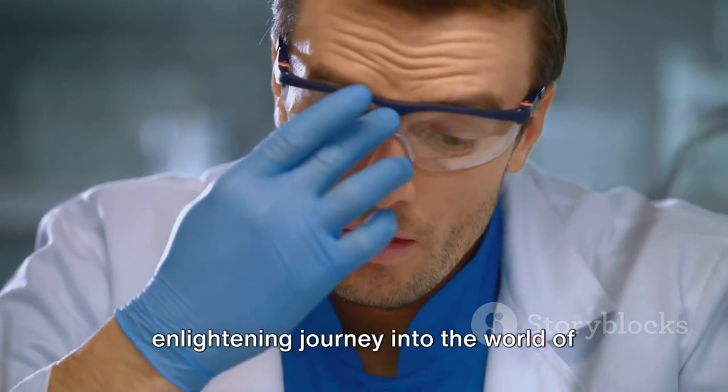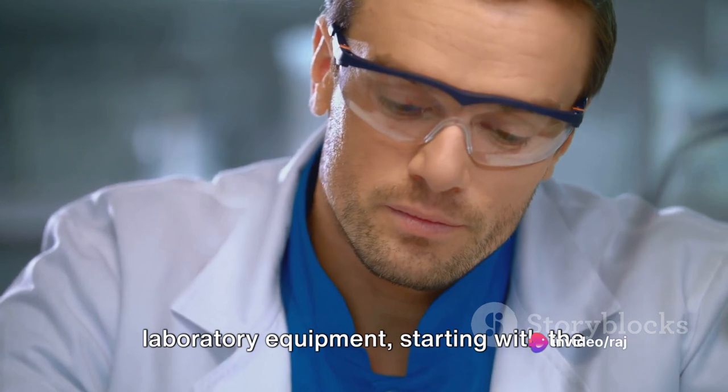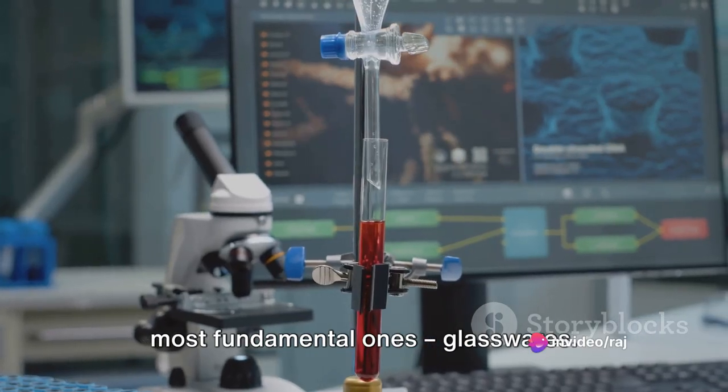So, buckle up as we embark on an enlightening journey into the world of laboratory equipment, starting with the most fundamental ones: glasswares.